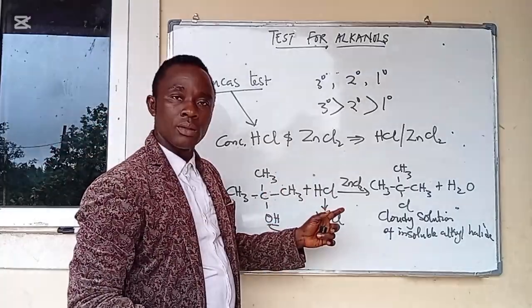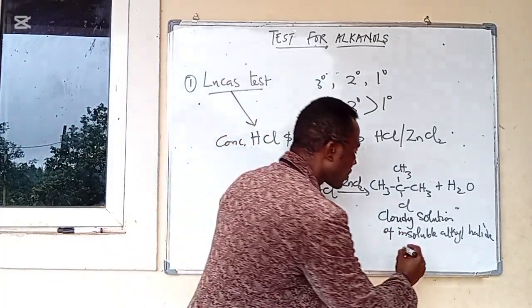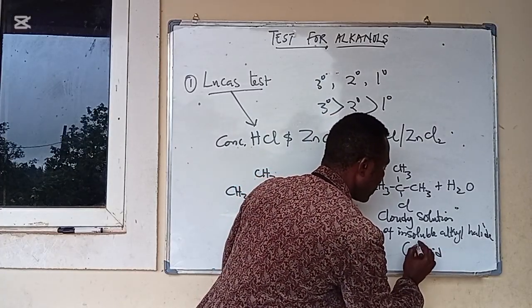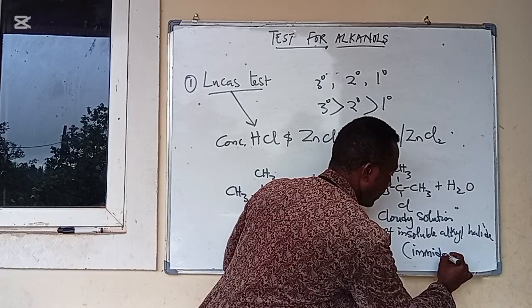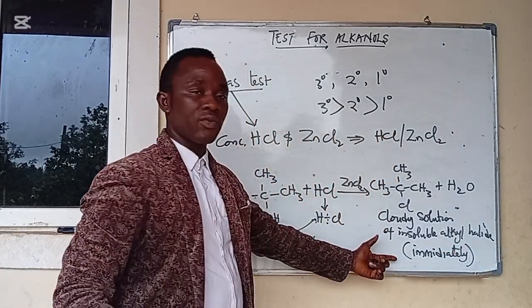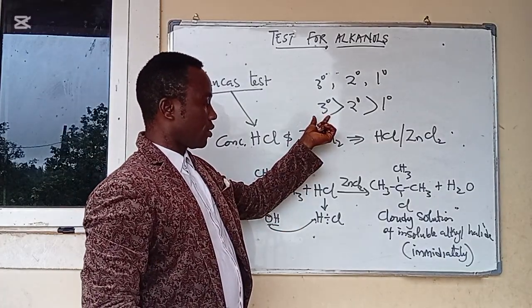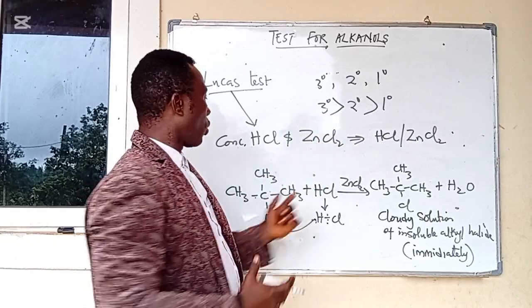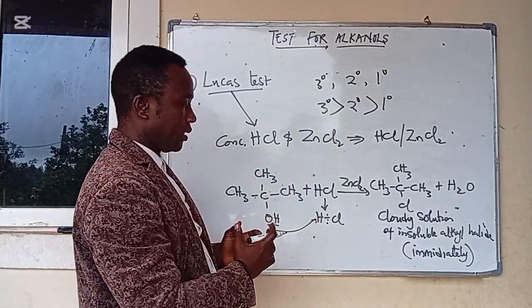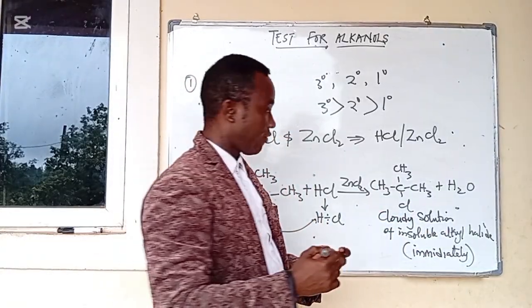Now the formation of this cloudy solution takes place immediately. That is to say that the reaction is fast. Remember, as I told you, tertiary alkanols react faster. So once you mix this reagent, immediately a cloudy solution of alkyl halide is formed.